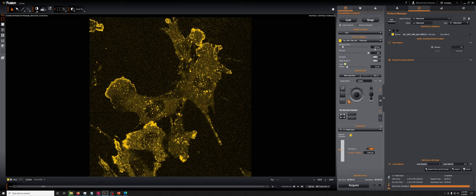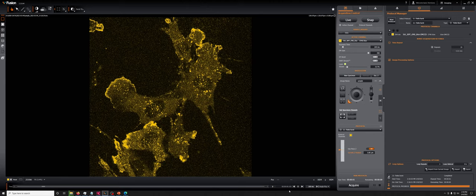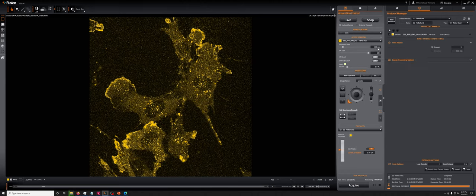So if we were interested in taking 100 millisecond exposures for an effective frame rate of 10 hertz, we're pretty much done. A 1% slowdown from that is going to be fine. Now, the nice thing about this camera is that because it is so sensitive, we can go significantly faster. We could actually get away with doing a 10 millisecond exposure and still get an image that is usable.